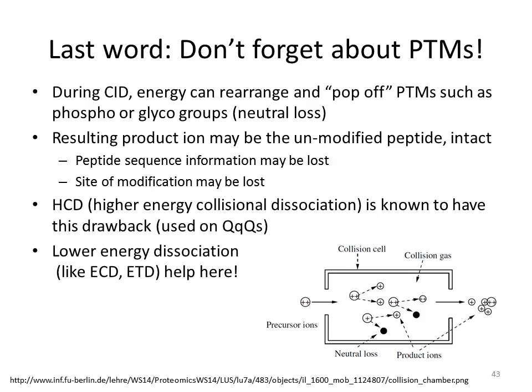Softer or lower energy methods of dissociation, like electron capture dissociation and electron transfer dissociation, can preserve post-translational modifications, and they don't pop off quite as quick. So unfortunately, triple quads are not ideal at working with PTMs. If it's something that is site-specific and you need to retain it, then it may not be the best instrument.